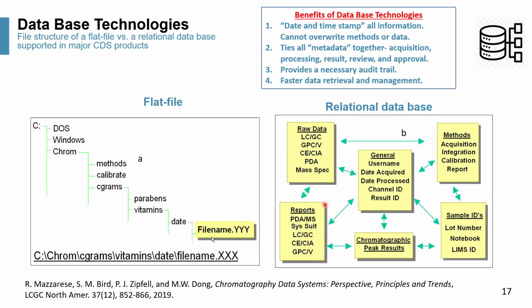Most modern CDS actually use a database technology. Instead of using a flat file format, a relational database is used to give you a bunch of benefits, right? It debuted in the 1990s with Waters Millennium, which eventually became Empower. Now most of the major vendors use this format, which is much preferred because it gives you the metadata related to the sample, and affords you faster data retrieval and management. So this is the way to provide the necessary audit trails.